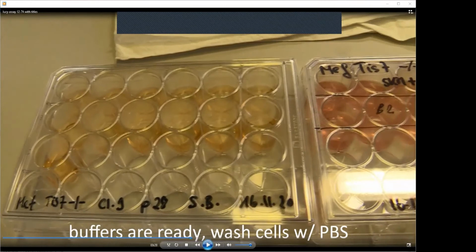Then the next step, once you have prepared these buffers, is to get rid of the medium which you have in the wells of your dishes, and then wash cells with ice-cold PBS. This is an important step because this medium would interfere with the reaction.